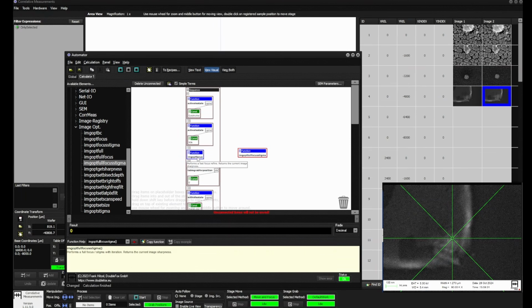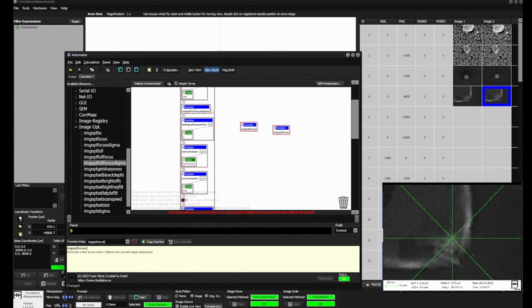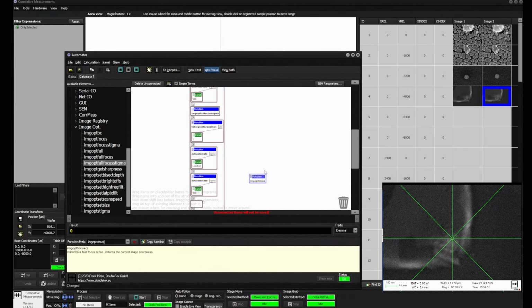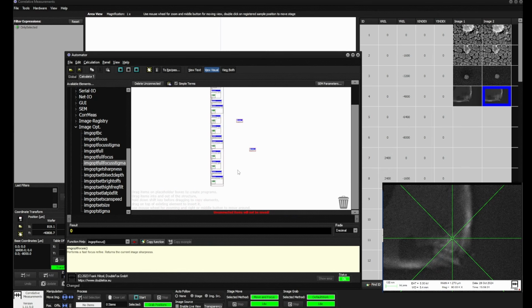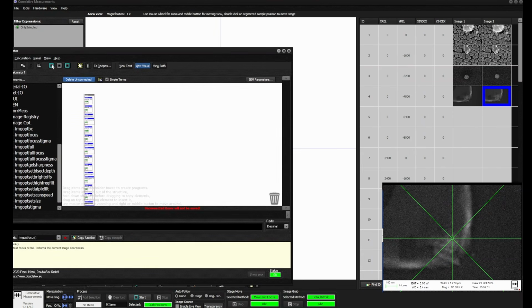Let's take this one here, this out, this in. Good. Next one, this out, this in, this out, this in, and this out, this in. Yeah, that's it. Can delete the ones there. Okay, let's try again. It will take significantly longer now.